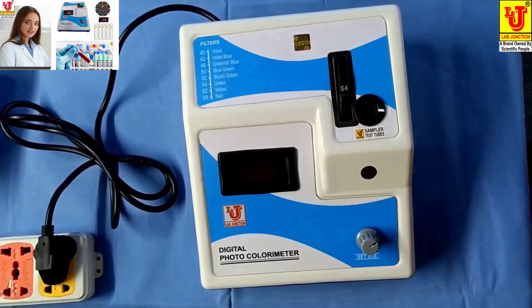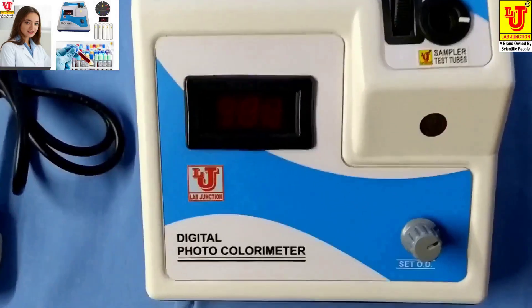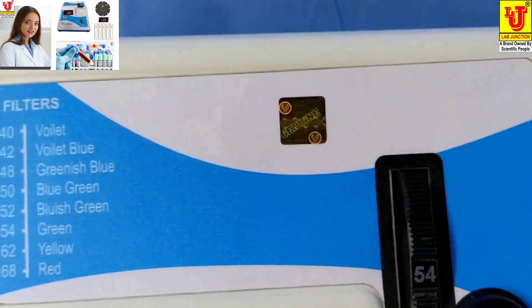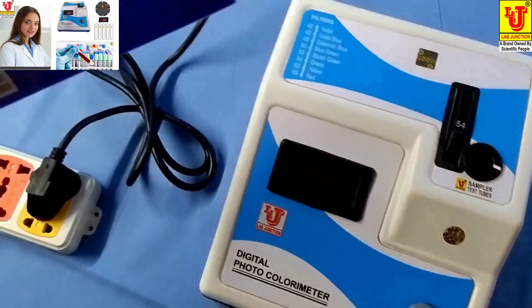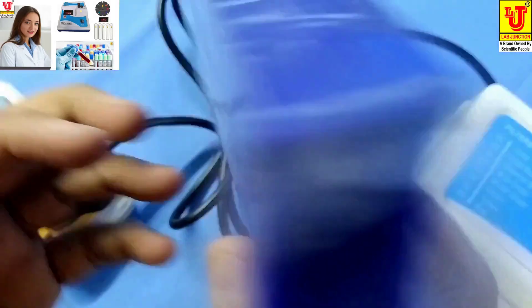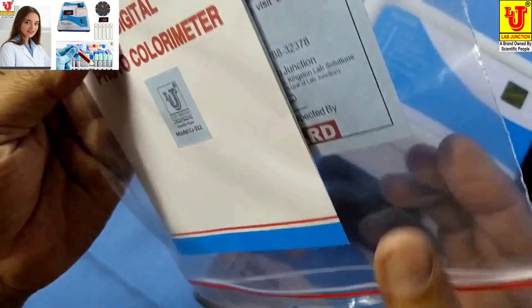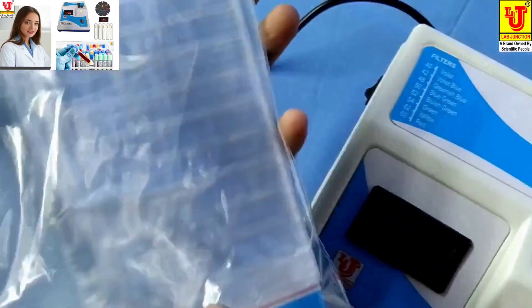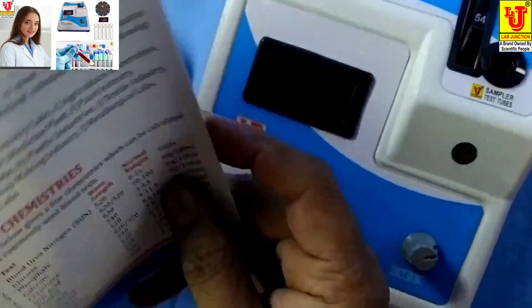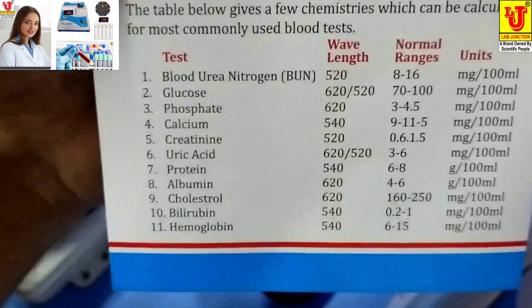Lab Junction's digital photocolorimeter, model LJ312. With this colorimeter, accessories are five test tubes, round bottom, with stand. Also included: instruction manual, warranty card, and test card. With this colorimeter, 11 types of tests are possible for blood chemistries.